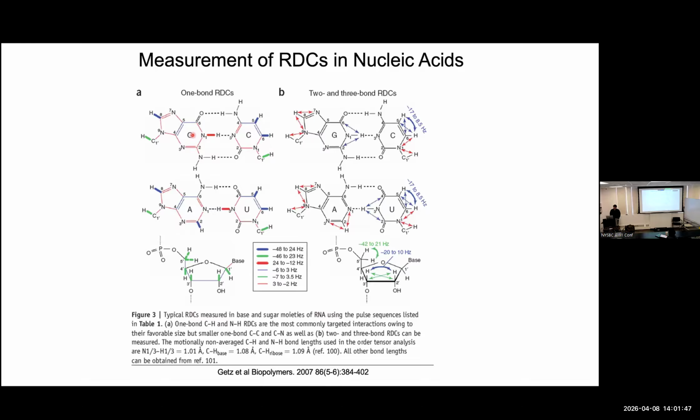Right. But more generally, if I have a very sensitive experiment, I get a very sensitive measurement. What does that mean about my measurement? It will have a small error. Very important, because in the ideal world, I want to say, hey, this is a very nice dipole coupling, it's 20 hertz. Well, does that mean anything? No, because the question is, with what precision can I measure? If that 20 hertz comes with an error of plus or minus 30 hertz, that's a useless 20 hertz.